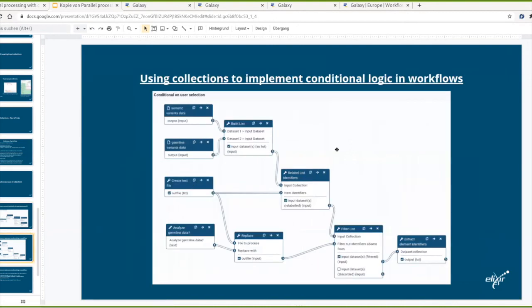The other thing with the conditional logic is shown here. That's another building block I like very much. This is actually from a cancer variant calling workflow I built. There you often have the problem that you want to call somatic variants, the tumor specific variants, but the workflow would also call germline variants and give you germline variant information about the patient sample. And in your final report, you might not want to have that germline variant information present because not every clinician looking at the data might have the permissions to know about this very private detail about the patient, their germline variants, right? So an oncologist should usually only care about the cancer variants in there.